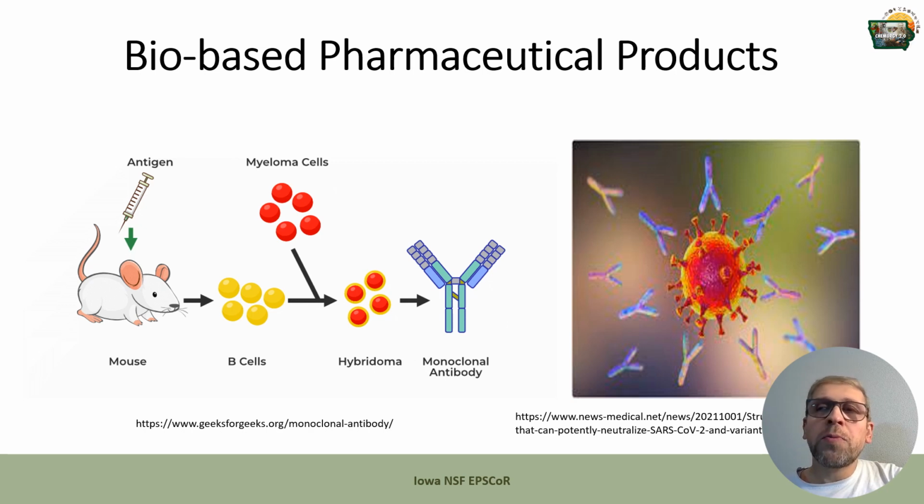Nowadays, a bunch of pharmaceutical products are made through living organisms, like antibodies. It's because they are more efficient, they are more compatible with our body, and they have fewer side effects. It seems that these bio-based pharmaceutical products make quality assessment much more difficult for us. But actually, it's a common challenge in biomanufacturing.